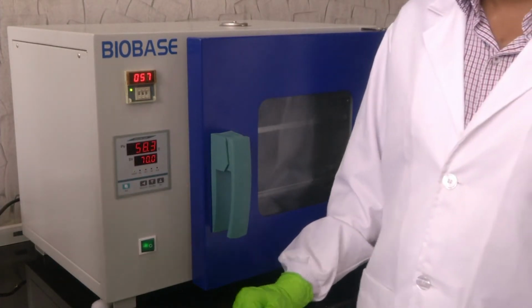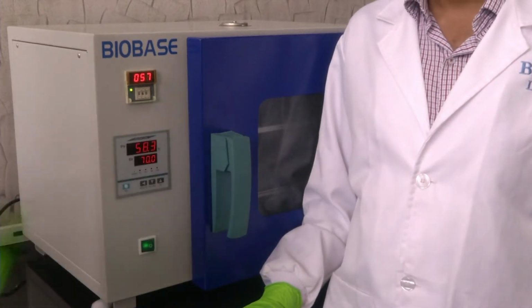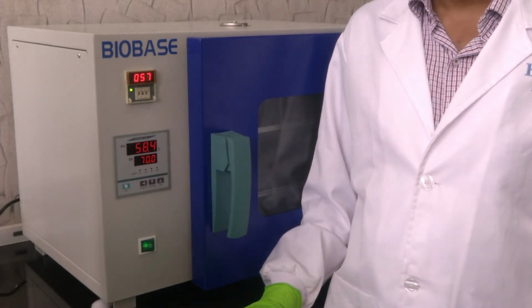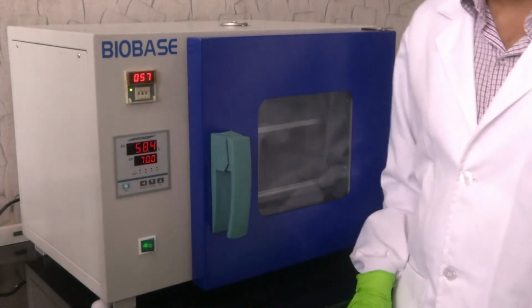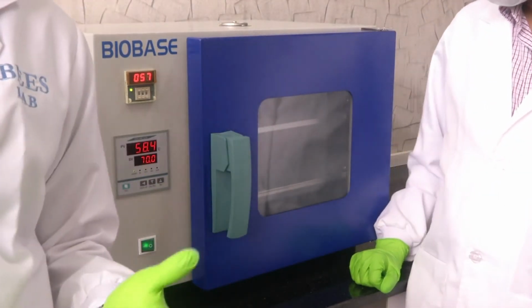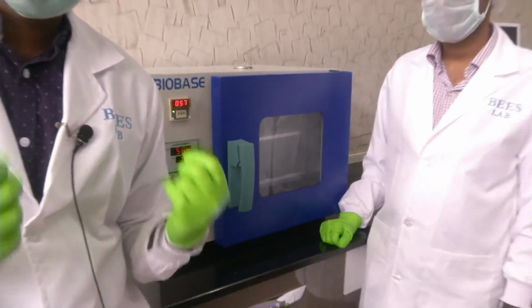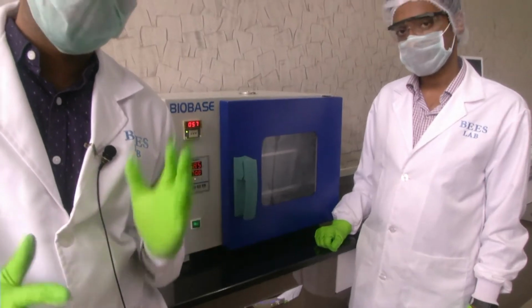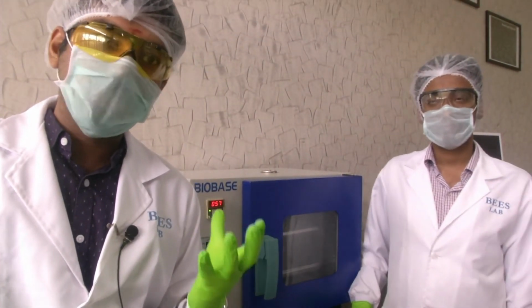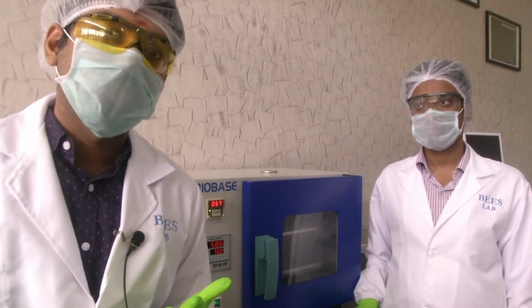Now we have put the sample in a glass petri dish as you have seen. Let us say the dish reaches 70 degrees Celsius, and suddenly you think that something is happening to your sample. Then you think, okay, I need to take my sample out immediately. Please do not do that. If you directly open and take your sample out, your petri dish is made of glass, right? The glass petri dish will undergo something called thermal shock.